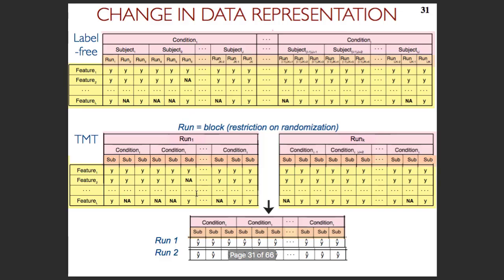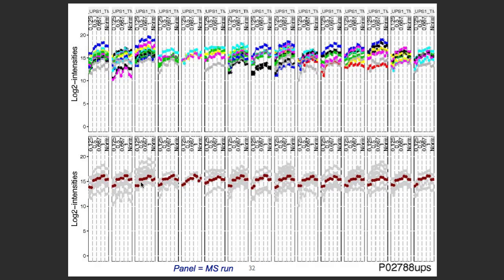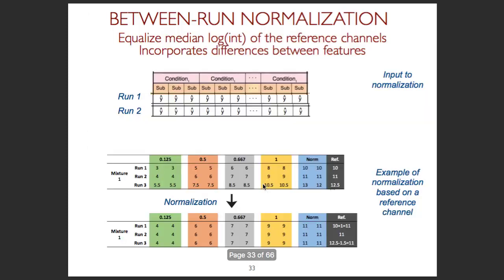Then if we use this summarization so that we have one number per protein per run, using censoring and using robust summarization, we will obtain summaries which look like that. The gray lines here, these are different ions, and the color line is the resulting summary.